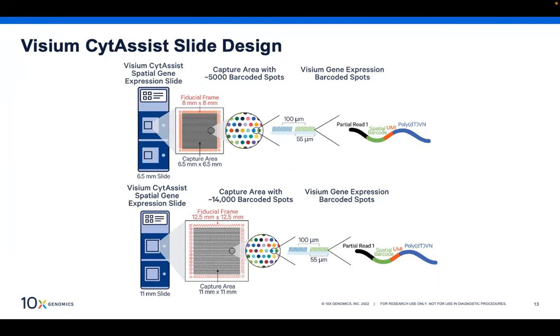And for those who are familiar with the DV200 score, that's an RNA quality score. With Visium enabled through CytAssist, that score can be 30% or greater instead of 50% or greater. So it's tissues that may be impacted perhaps by a fixative used alongside of formalin, or something that may have been decalcified slightly or affected by cold ischemic time, those are now opened up. You open up access to more specimens with a little bit lower RNA quality to them.